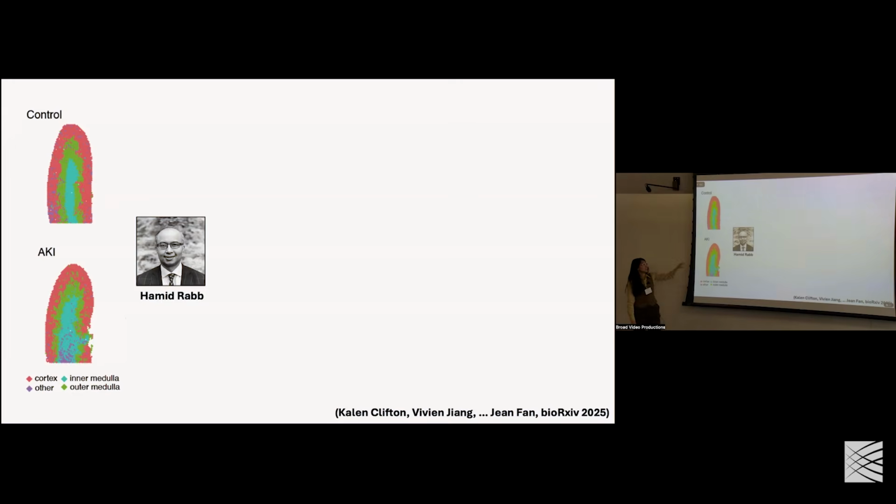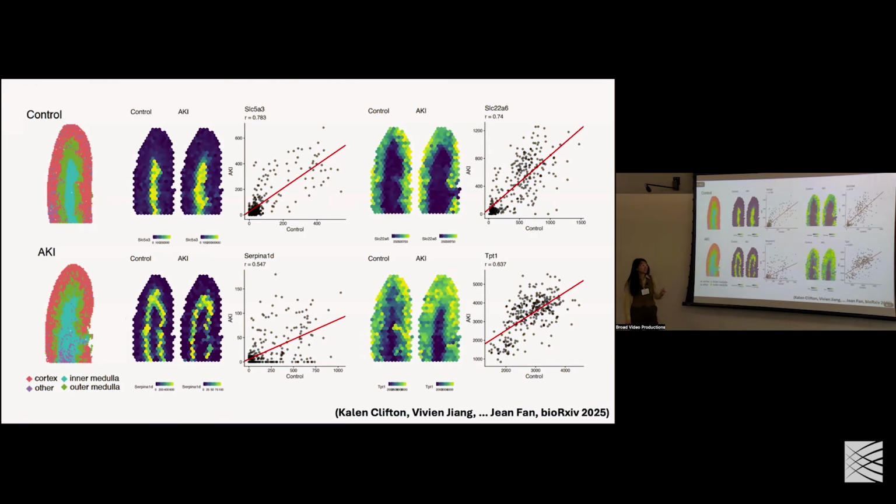So we can use STcompare in this case to identify, for example, all the genes that are significantly positively correlated even after multiple testing correction according to our empirical p-value. And as you can see here, I structurally aligned the tissue. I again rasterized to a certain resolution that allows me to compare at matched locations. And these are a few examples of genes that we find as significantly positively correlated.